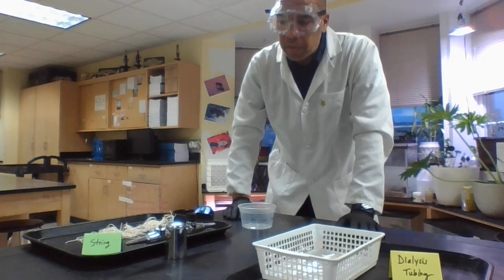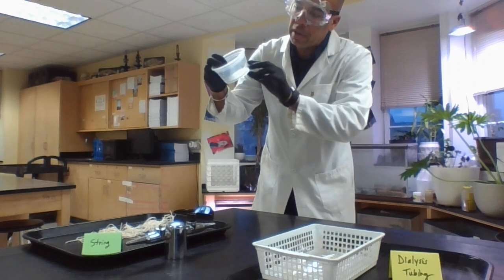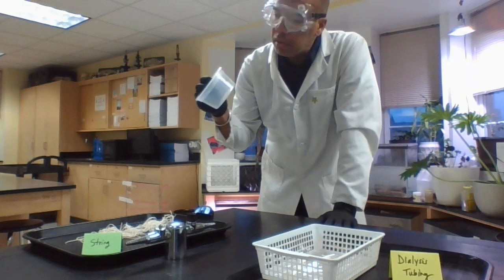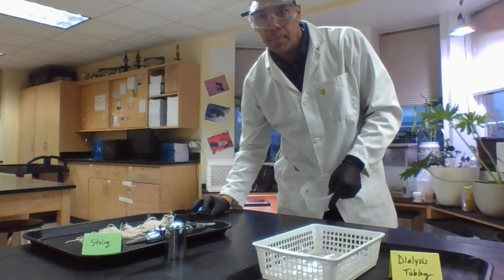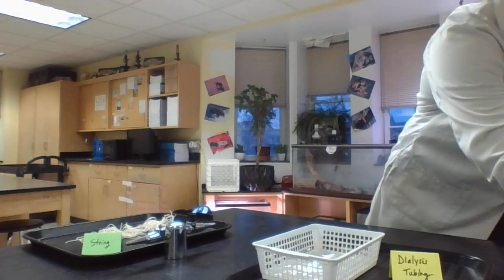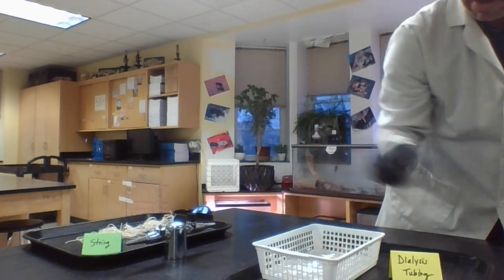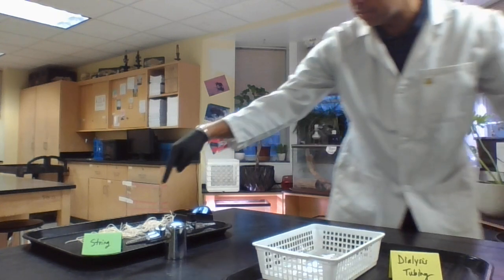Okay, so I'm over at the lab counter. One partner will bring your little bin and fill it up with water, probably about halfway or three-quarters of the way up. So you do that in your sink. While one partner is doing that, the other partner is going to grab dialysis tubing and 2 strings.